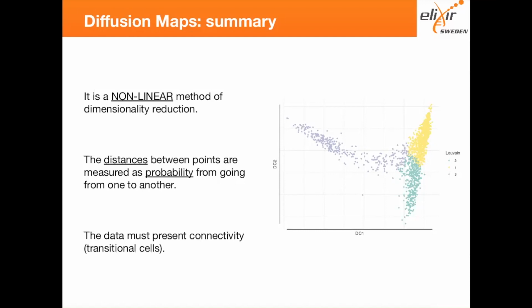Yes, exactly. As long as you know the starting point, then it's much easier to define trajectories as well. Because then you know that you have your path, you already know the biology a little bit behind it, right? And then you can set whatever developmental path it is, maybe cancer, maybe stem cell biology, or activation, immune response, it could be anything.